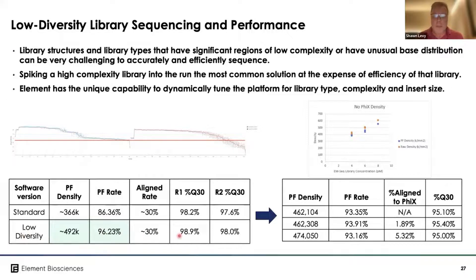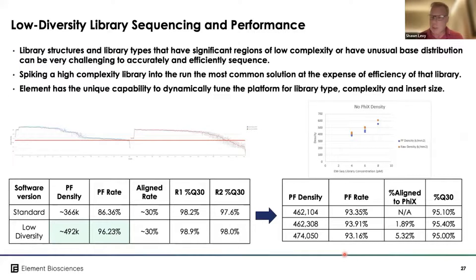We developed a low-diversity analysis pipeline and achieved much improved performance, with pass-filter rates reaching 96%, but we still had to include 30% PhiX. Knowing that giving away 30% of reads was not optimal, we reworked our approach. We've now achieved pass-filter rates above 93% with either zero, two, or five percent PhiX targeted — maintaining very high Q scores and high pass-filter rates. Using PhiX is now an optional capability in these low-diversity conditions.